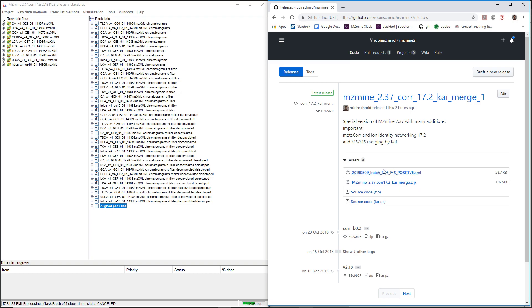We also have some batch files just for the basic parameter settings, and you can also download those and just use them as a start.